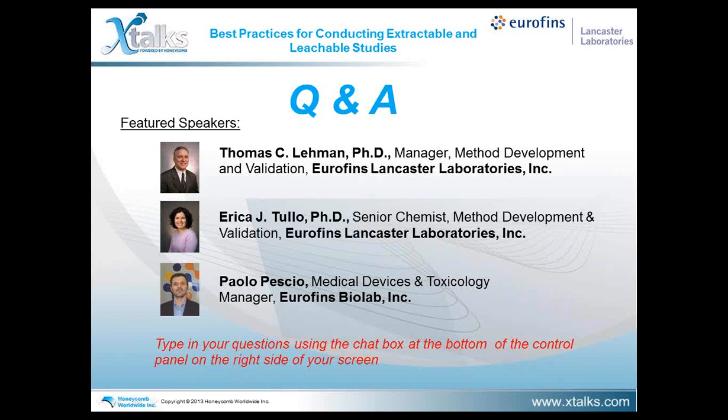Another question here. How would you evaluate a known compound without or limited toxicological data? Can we use in silico prediction? Yeah, we can use in silico prediction for this kind of compound if we know at least something about the compound. When we have really an unknown compound, we cannot perform an in silico prediction. And generally the approach is to use the TTC approach, and in case we are over the TTC limit, we have to monitor them in the leachable study.